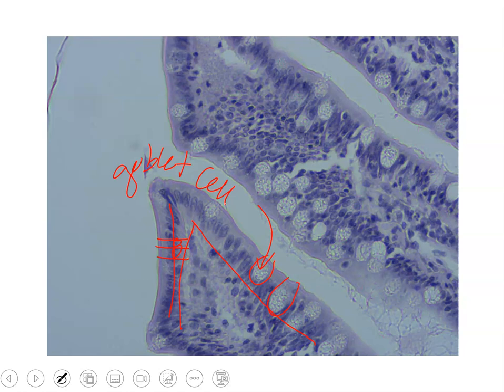And then in the intestines, you might see small extensions at the apical surface of the simple columnar epithelium known as microvilli. And these are important for creating surface area at the top of the epithelium so that we create more surface area to allow for absorption of nutrients. We know the intestines, specifically the small intestine, is important for the absorption of our small molecules of food. In the large intestine, we know the simple columnar epithelium is important for the majority where our water is absorbed.